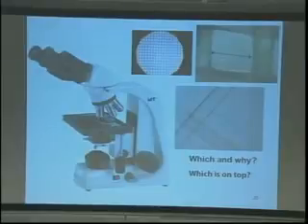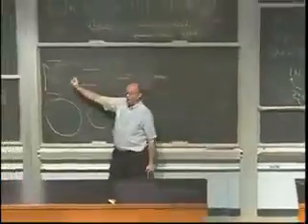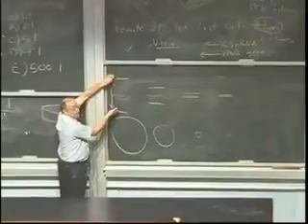Probably the number one thing I help students with is they go in lab and say, I can't find any paramecium, I can't find any amoeba. Next week when we look at these things, within usually no more than 15 seconds, I might find 10 or 20. And I didn't have spontaneous generation, as you know. All I did was I almost always switch from the high power to a low power because it gives me a bigger field of view to look for the specimen, plus a bigger column, bigger depth of focus.